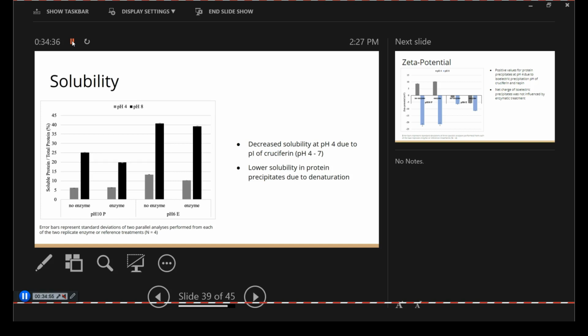The potential problem could be that the salt concentration, whatever the amount, even when dilute, adds ionic strength that can give false reports for solubility as well as zeta potential, because the salt will either increase or decrease the charge. It can shield the charges or interact more with water and impact the functionality of the protein.